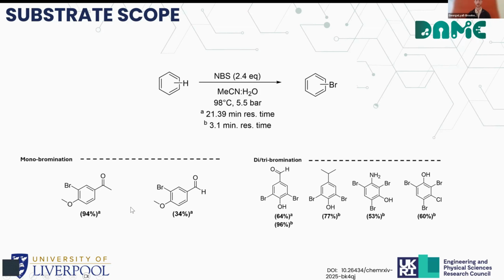And all of these monobrominated species were obtained over a residence time of 21 minutes, again due to the weaker electron donating properties of the methoxy group.